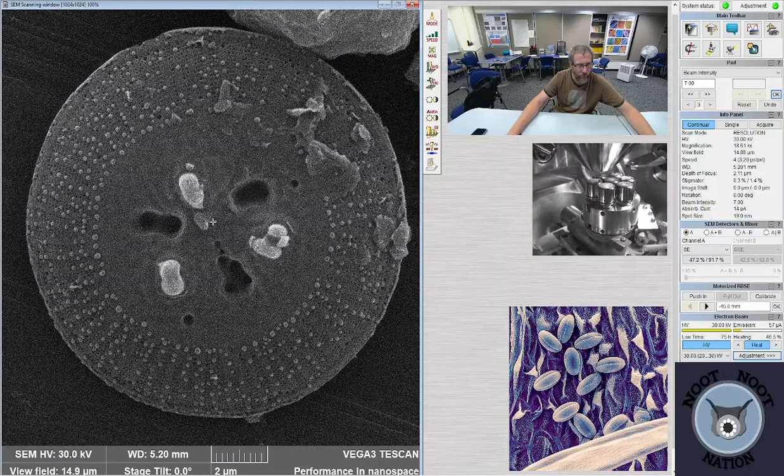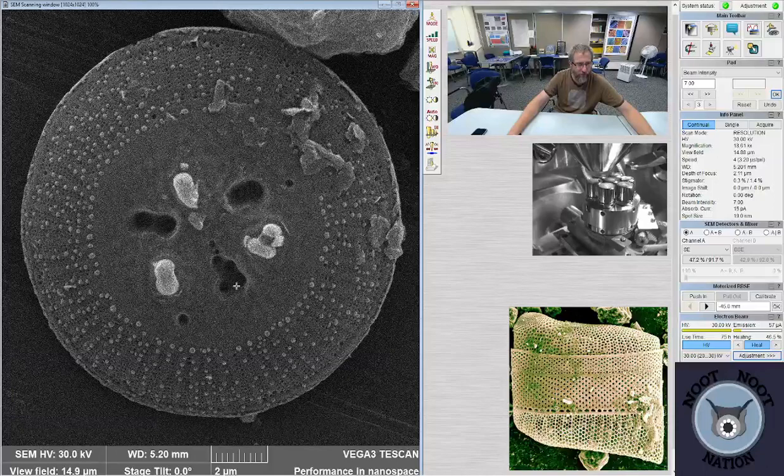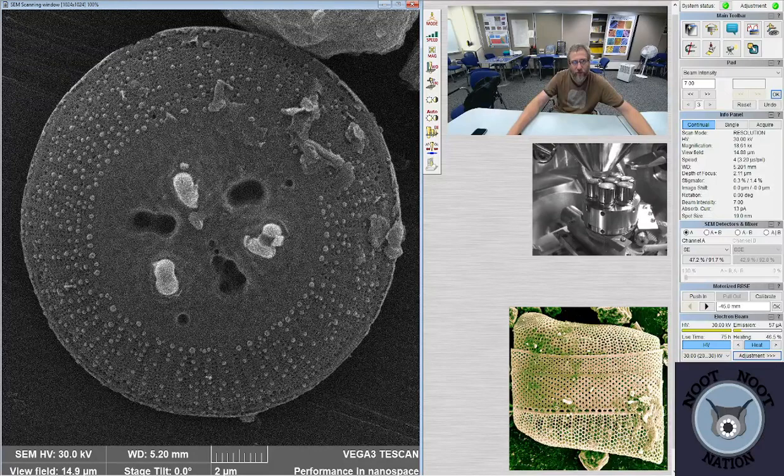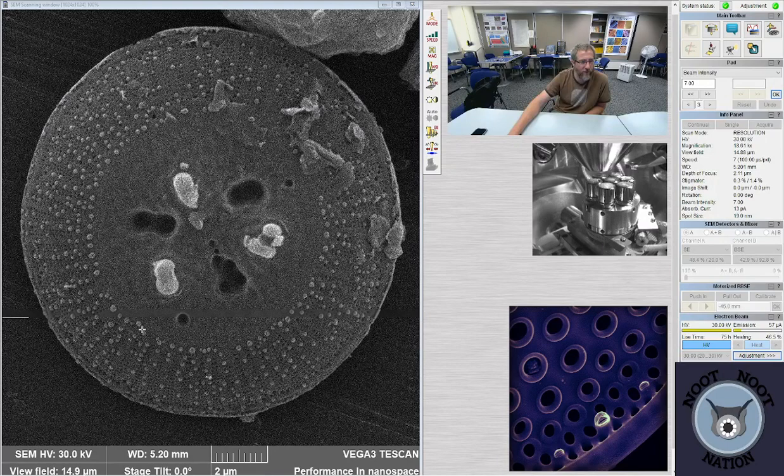It's characterized by having these elevations. So there's like depressions here, three depressions and three elevations that are next to them. It's nice and it's mostly clean. There's a little bit of clay up here, but the surface is mostly clean. So I just thought I would stop and make sure that everything's looking good in the actual picture-taking process. But it's characterized by those depressions.